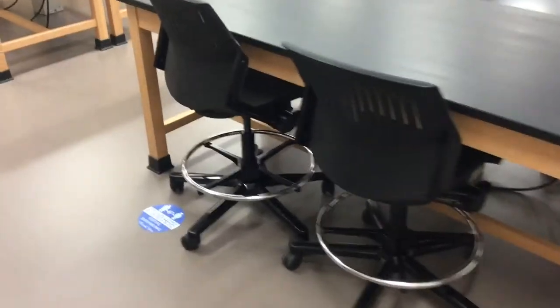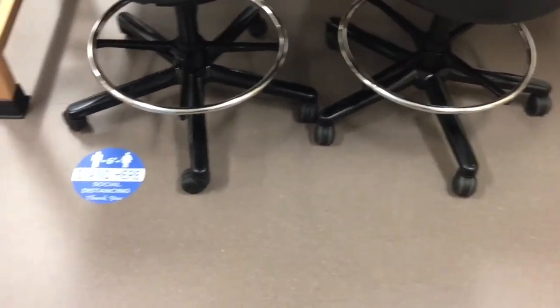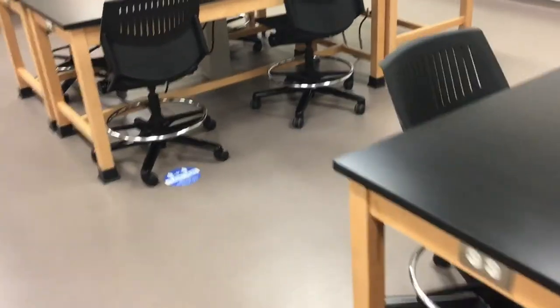In the lab there will be blue and white dots on the floor showing you where to sit. They're set six feet apart from your partner diagonally, as well as six feet apart from other tables. Please avoid sitting at any seat without one of these markings.